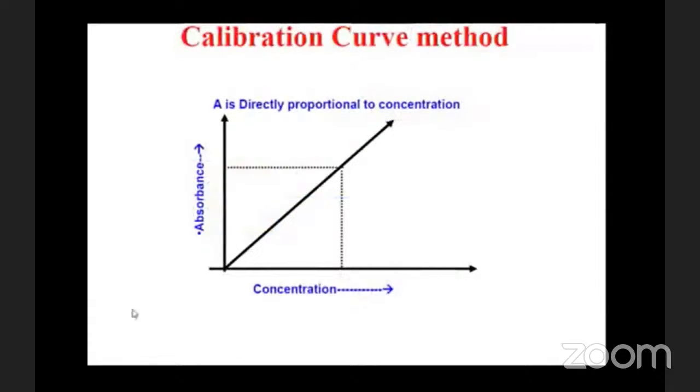We already discussed this method in flame photometry. In this method, a series of standard solutions containing known amounts of the element is prepared, for example, 1 ppm to 10 ppm. The standard solutions and the unknown are then introduced one by one into the flame, and their absorbance values are determined. Before each solution is sprayed into the flame, distilled water is introduced into the flame and the reading is adjusted to zero absorbance. This is a more important step to remember.